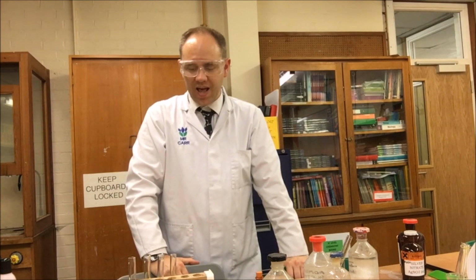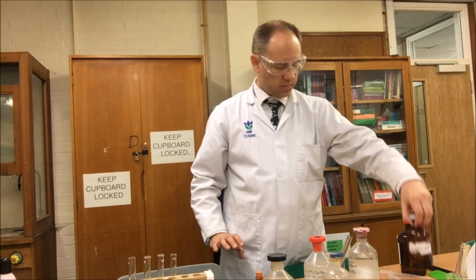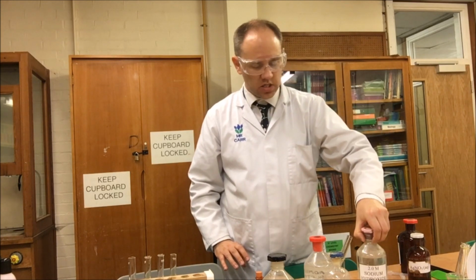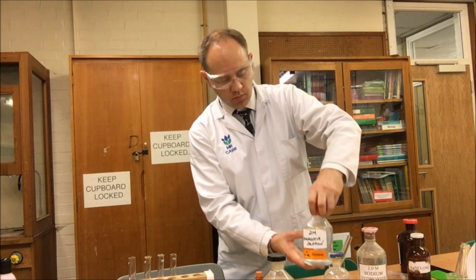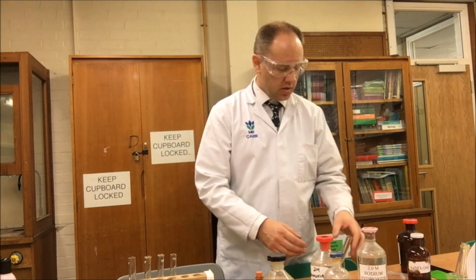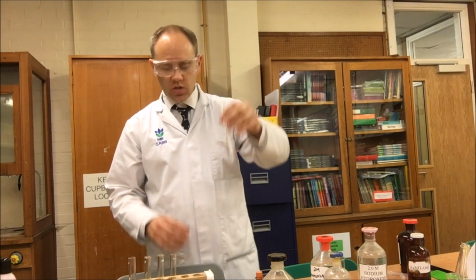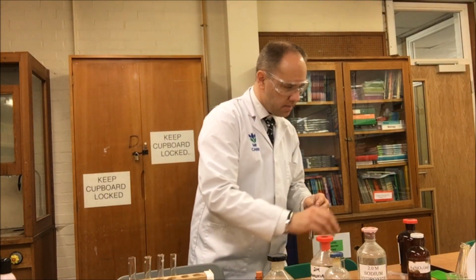Now, the next test that we are going to do is for the aldehydes, and to do this we need Tollen's reagent. Tollen's reagent is a mixture of silver nitrate, sodium hydroxide, which we've used from acids and alkalis since year 7 all the way up to year 13, and some ammonia, which is actually a cleaning product. So what I have done is I've already created a small amount of Tollen's reagent, and I'm going to place this pretty much as I can.